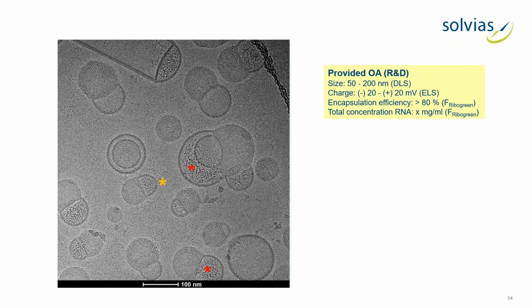But what can experts see? The expert can realize what RNA is hidden inside and outside the system. But note, these are always only a snapshot and limited to a really small view window. And we should be aware, LNP systems are highly dynamic systems. cryoEM is in fact a really fascinating technique, but it will never be used under GMP in routine control, but could be a really helpful pillar during the development of new technologies.